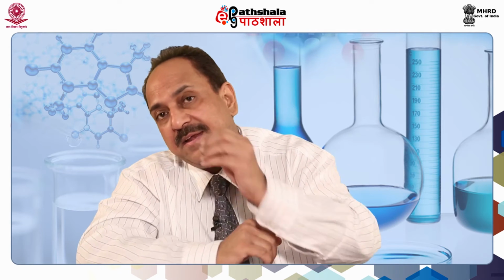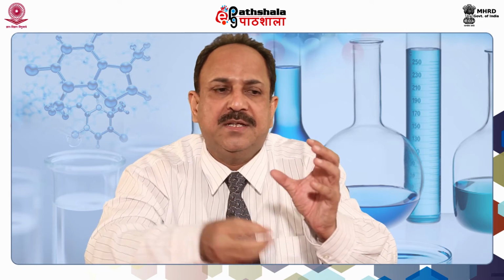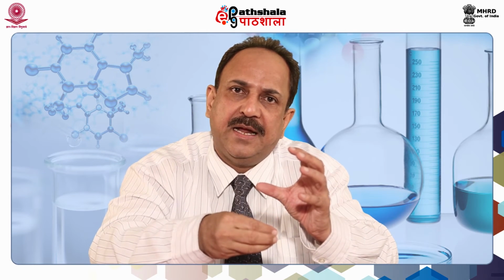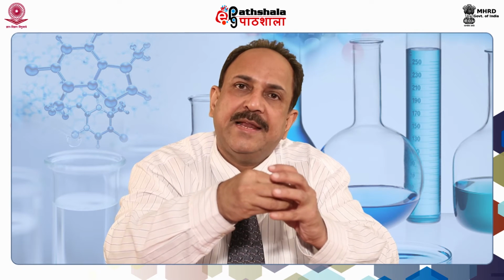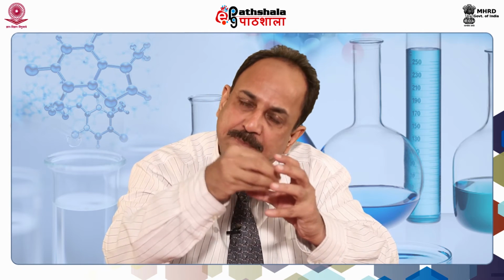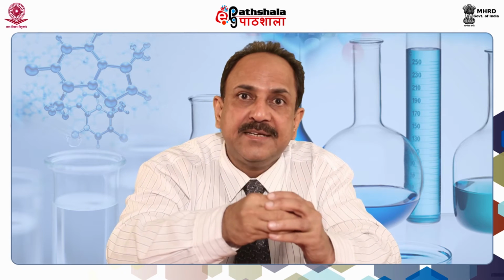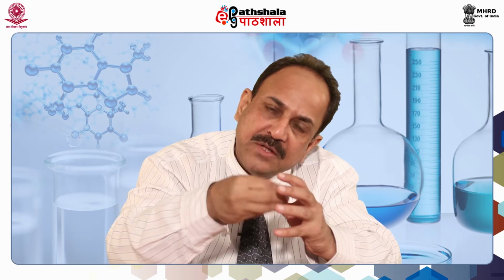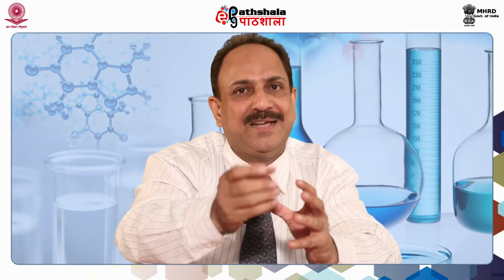That is, when we have any ligand bound to the three-dimensional structure, let's say it's an enzyme, and the substrate is sitting in the active site, because we can have the structure with the substrate bound to the active site.